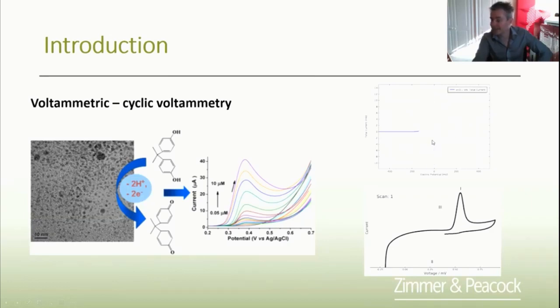Ferricyanide is a real classic in electrochemistry. And what's happening in this animation is it starts off at about minus 500 millivolts. We scan towards 500 millivolts. And when we hit these critical voltages, you then get the flow of current first in the positive direction, then in the negative direction. Positive, negative, positive, negative. And that's really reflecting the oxidation of a molecule and then its subsequent reduction.